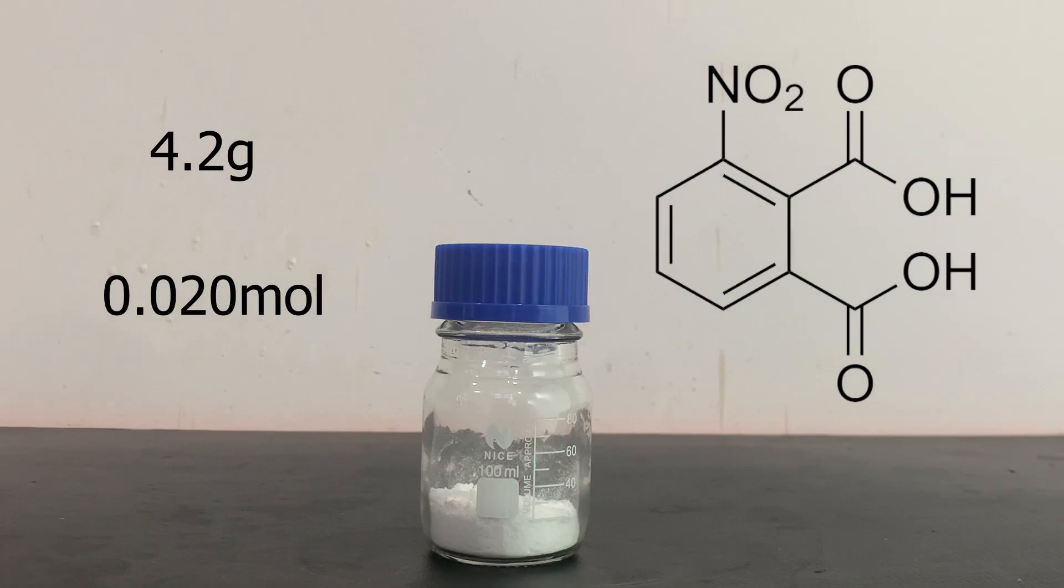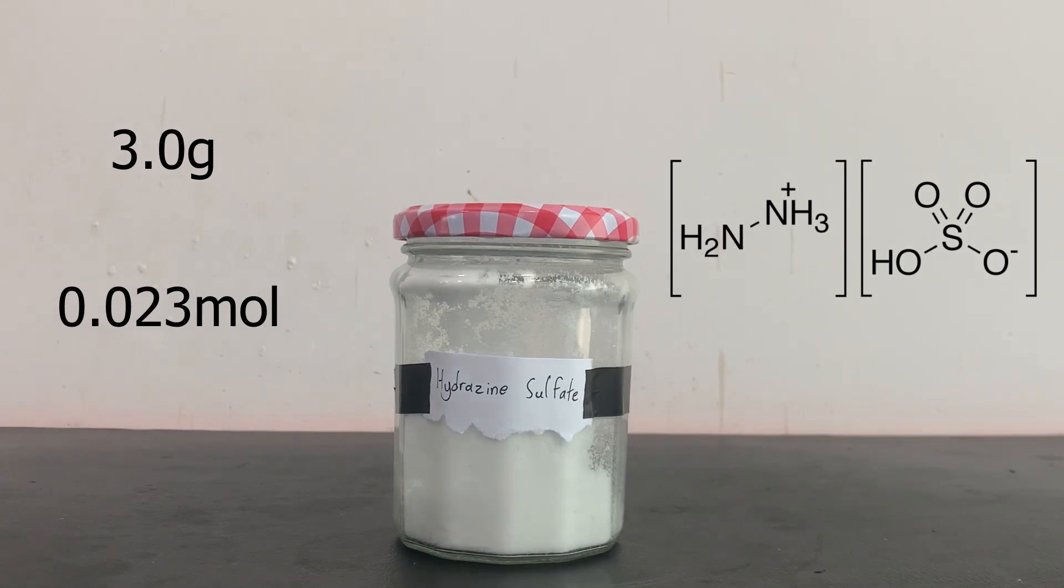For the chemicals required in this synthesis, we will need 4.2 grams of 3-nitrophthalic acid, which I have shown how to make in a previous video, and 3 grams of hydrazine sulfate, which I have also shown how to make in a previous video.